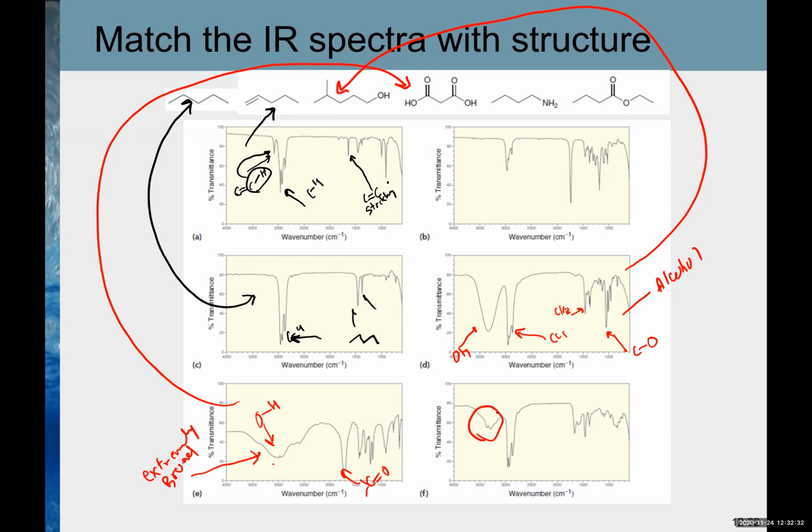F. What do you think? What's the meaning of this? Is that a unique thing happening in F? It represents the nitrogen attached to the 2 hydrogens. Yeah, that is representative of a primary amine. So this is NH in a primary amine. So the only amine we have is this one. So that is the amine. Yes, you can analyze the rest of the peaks also.